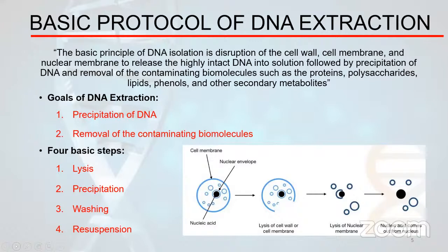After that, the DNA which is available in the solution will be precipitated accordingly to remove all the contaminants, which are molecules other than DNA, and finally the purified DNA is obtained at the end of the DNA extraction. So the goals of DNA extraction are mainly precipitation of DNA and removal of the contaminating biomolecules. This protocol normally takes place in four steps.